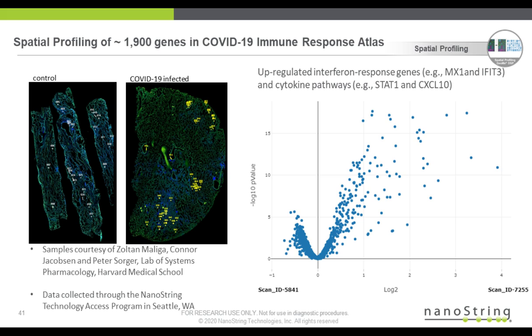Yeah, I'm looking at my timer. I'm actually right on time for where I wanted to be. But hopefully, in summary, of this technology development we did for both blood-based systems, we got some great results. With a 2-day turnaround time, you get 800 answers. You can focus on what the biology of these COVID-19 patients looks like at the patient level. And you can see we already got work that made it all the way into the New England Journal of Medicine. So you can really get high quality, high impact manuscripts out in this area.